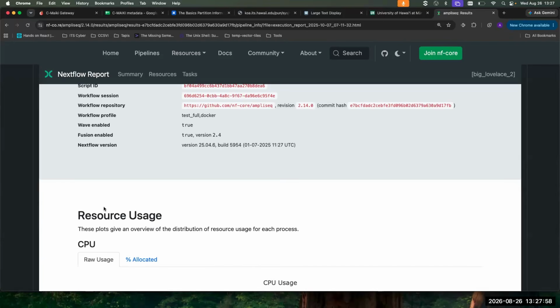Okay, now to be clear, our old pipelines are still up there and at work. They've been up there for 5, 6 years. We haven't changed anything about them, except that you now have to input a metadata file to run.